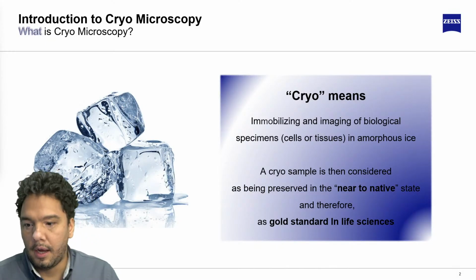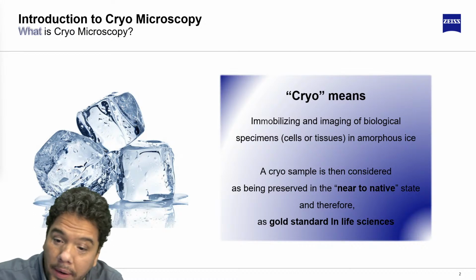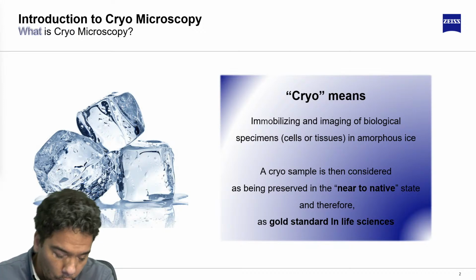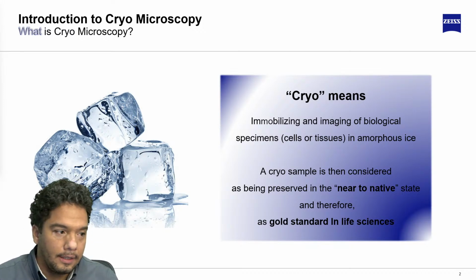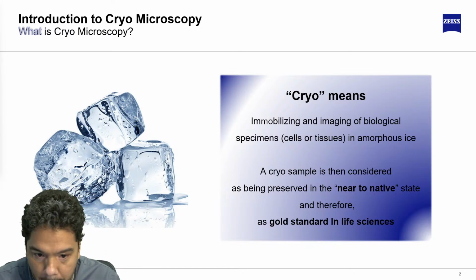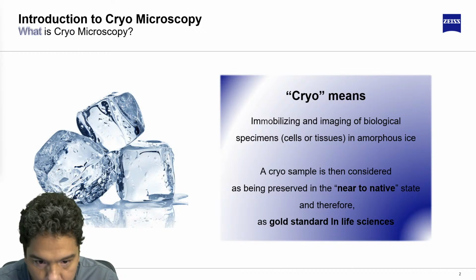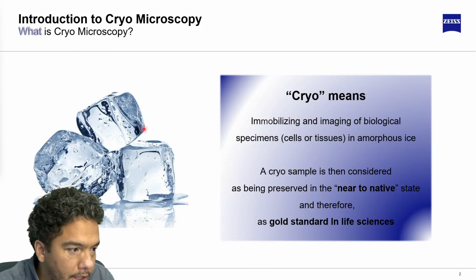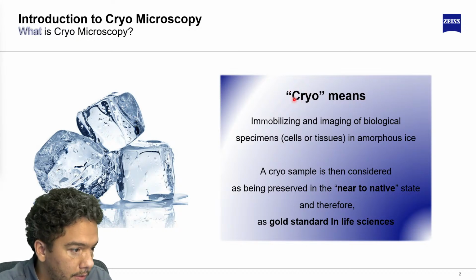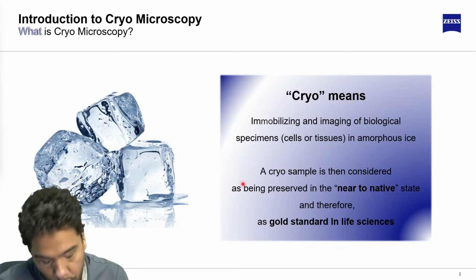Today we are discussing cryo-microscopy. What does cryo mean? Cryo comes from a Greek word, spelled with a K, that means low temperature.